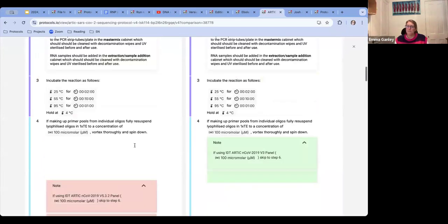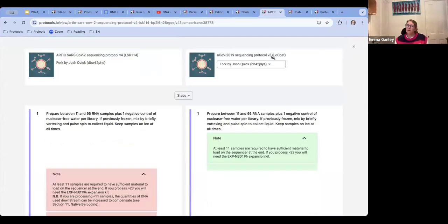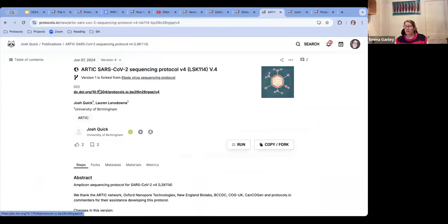Again, it looks just like the notes at the top. There probably are other things in here if I scrolled down, but that's the ability to update with new versions. So it's very nice, very dynamic functionality that allows you to keep your protocols updated as they continue to evolve, because rarely will they stay static. I think that's typical generally.